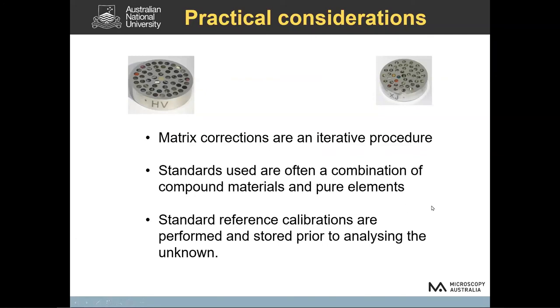We don't do a comparison of the unknown and the standard every time we do an analysis. Often the reference calibrations are done well ahead of time and stored, so they can just be recalled, and all you have to do is collect the unknown, and all the information that you need to do this quantitative analysis is ready to go.